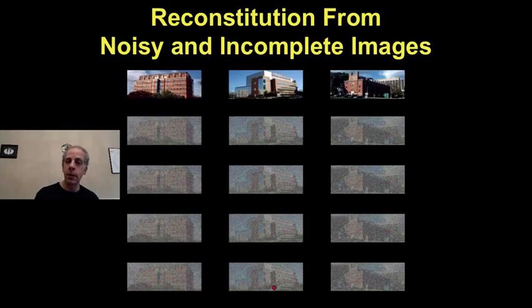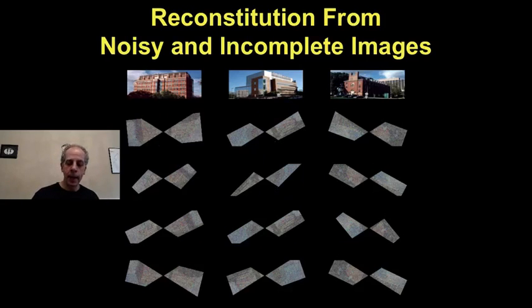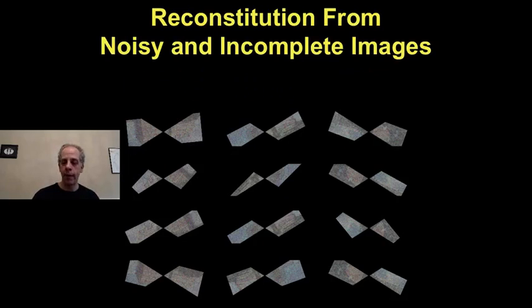Very noisy, okay? That's not so good. The multiple copies is good, the noise is not very good, but we have to deal with that. We get them rotated. That's also not very good, but we're going to have to deal with that. And then we get the missing wedge. Okay? And of course, we don't have the originals. This is what we have.